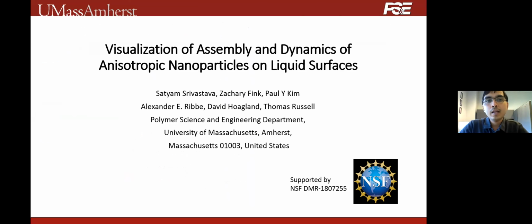Today I will talk about how we use electron microscopy to study assembly and dynamics of nanoparticles on liquid surfaces, especially anisotropic rod-like particles.